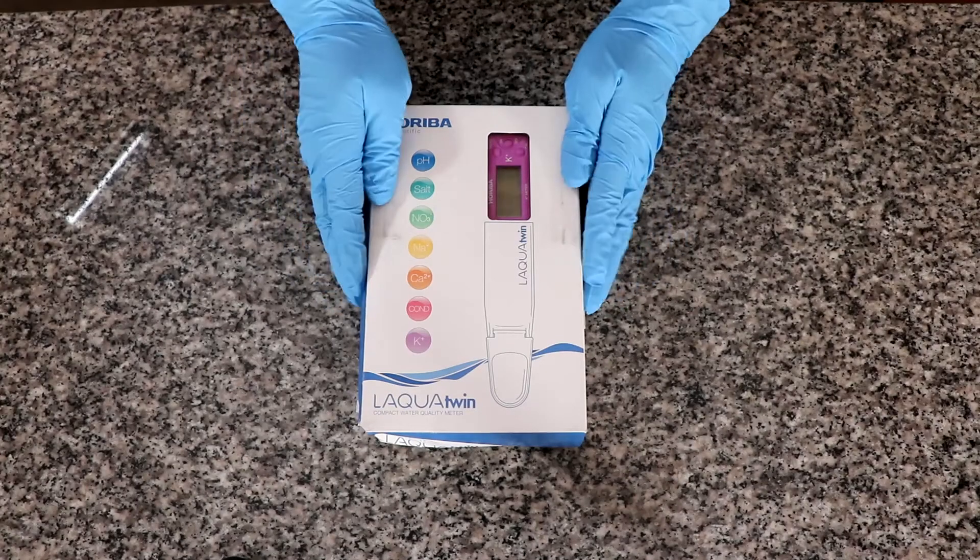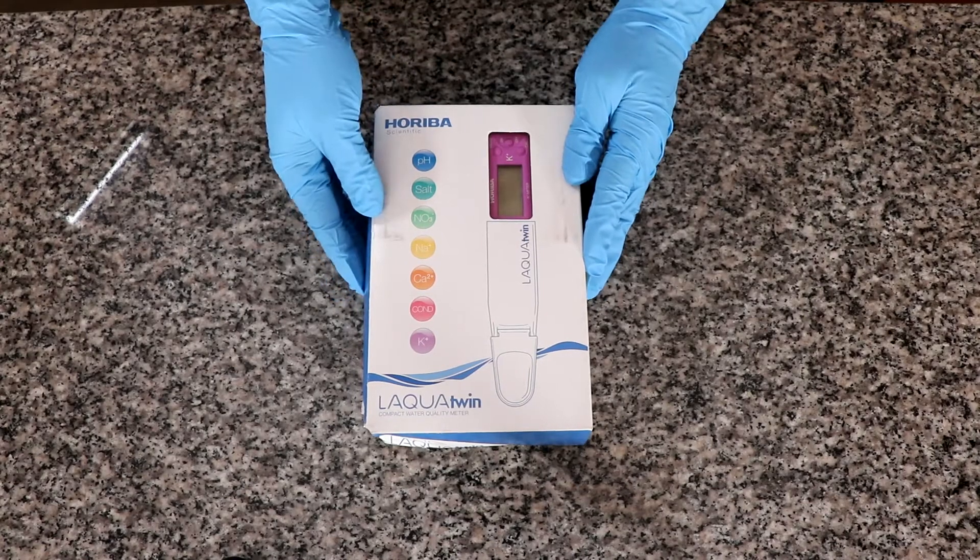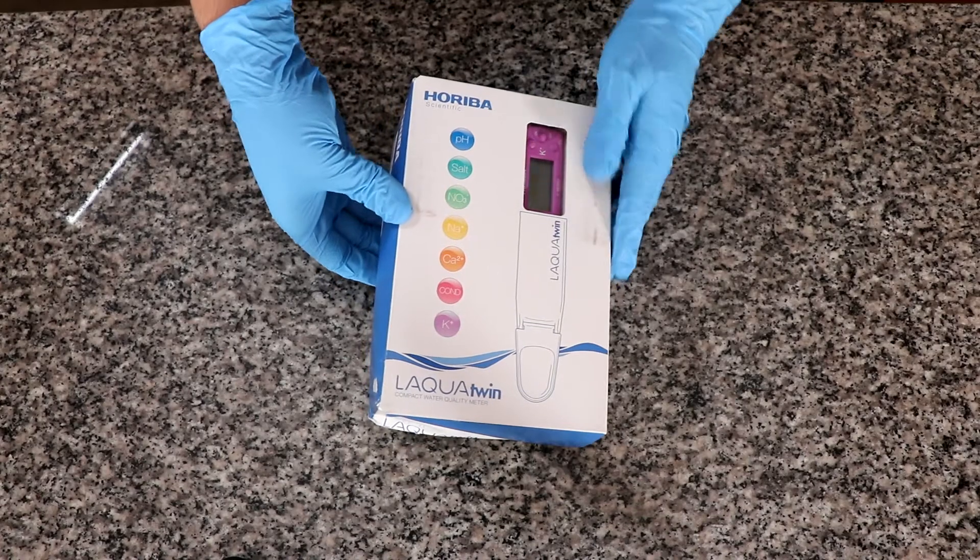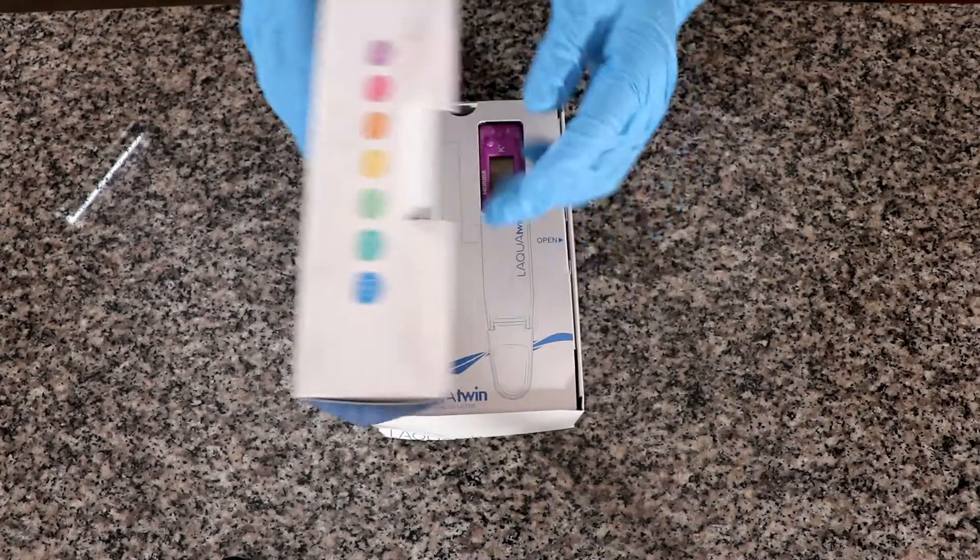The objective of this ion selective electrode is to allow us to measure potassium in a hydroponic solution or in any solution within a certain concentration range. So let's unbox this and see what we are getting.